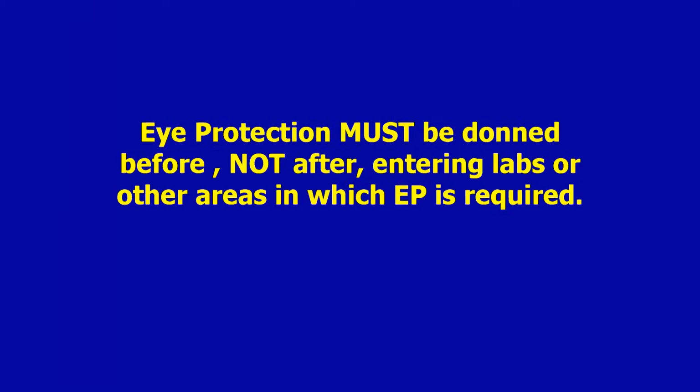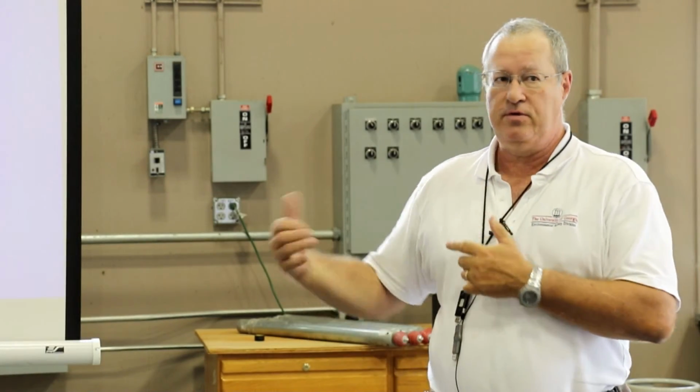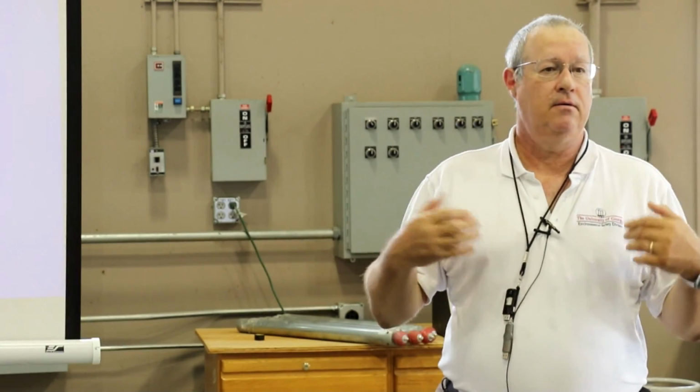Don't walk into a lab and say, oops, I have to have my eyeglasses on, then put them in, because it might be too late. Standard lab procedure on campus is you have this protection before you enter a lab. When I or one of the folks on my staff go into a lab to check a hood, an eye wash, safety shower, or do other sorts of things, we first look in there to see what the people who are working in the lab are equipped with, and we follow their lead.